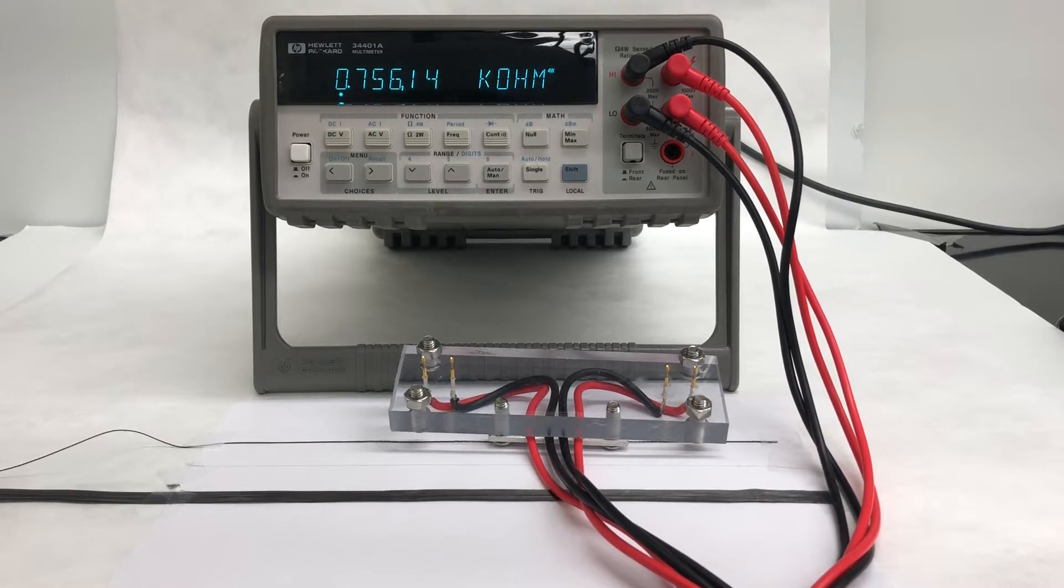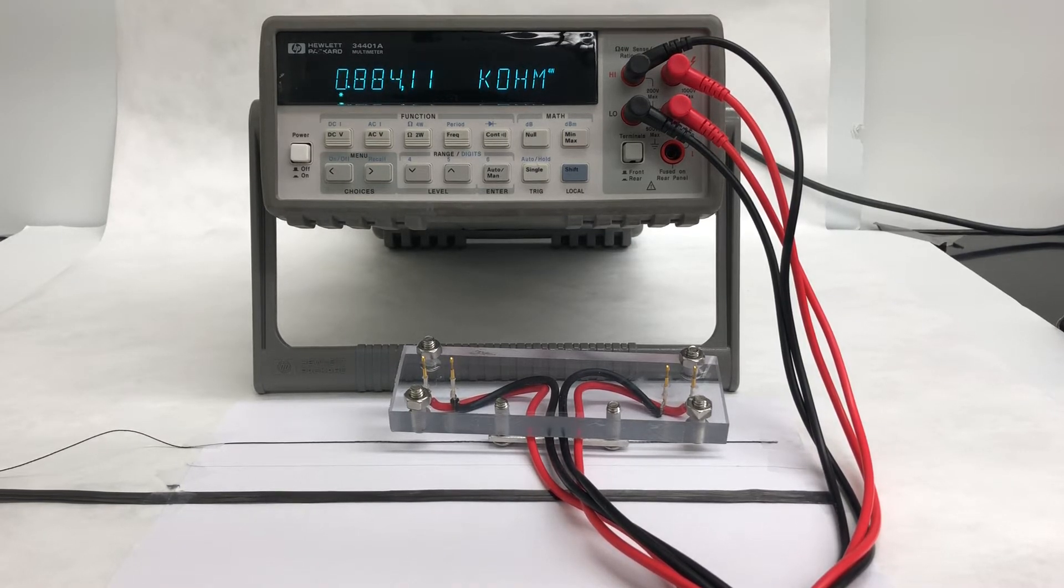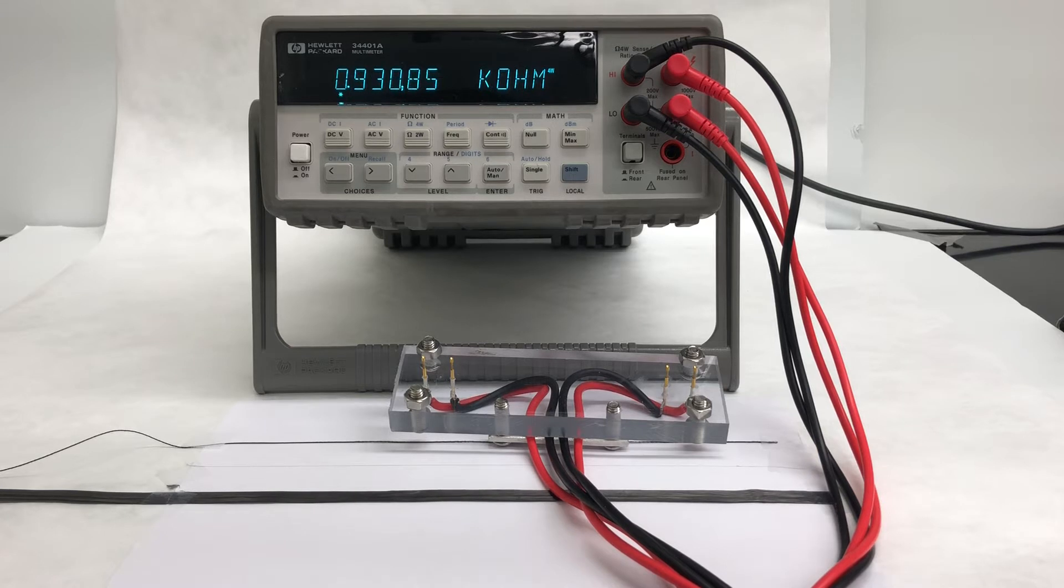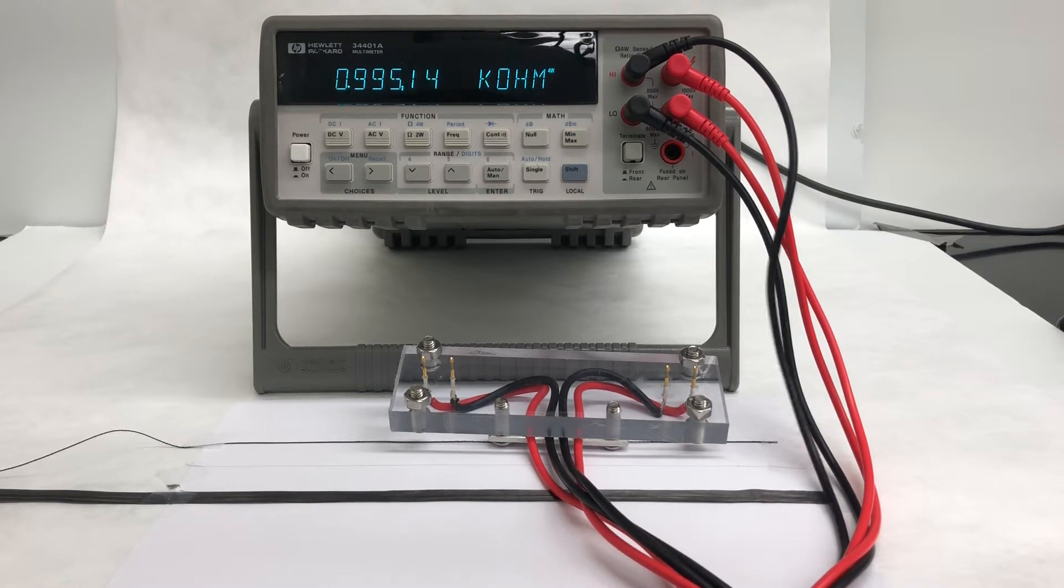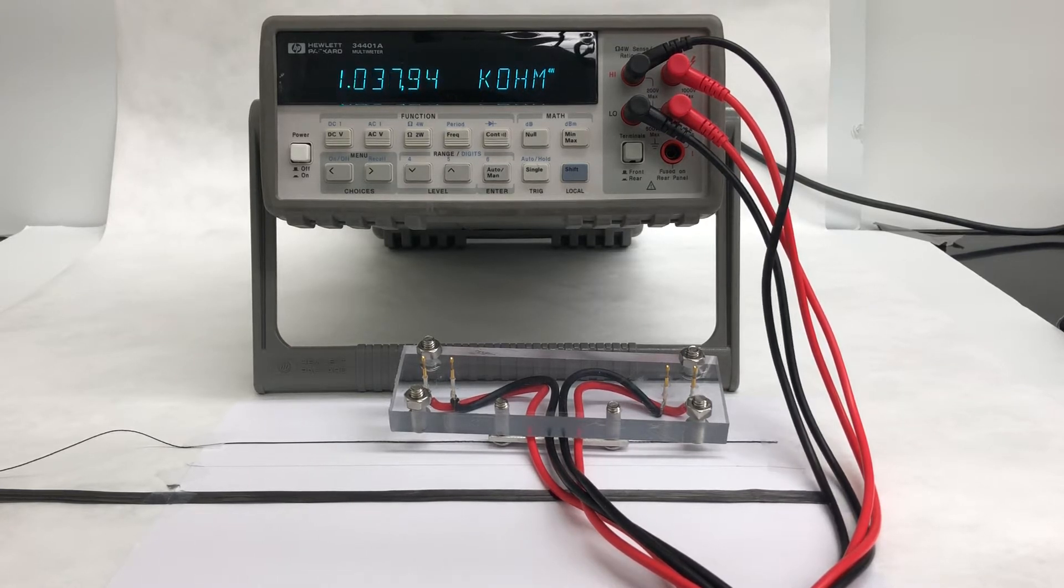Hi, this is Colin from Nexmat. Today I'd like to demonstrate the way that we measure the electrical resistance of our carbon nanotube materials, which allows us to calculate their conductivity.